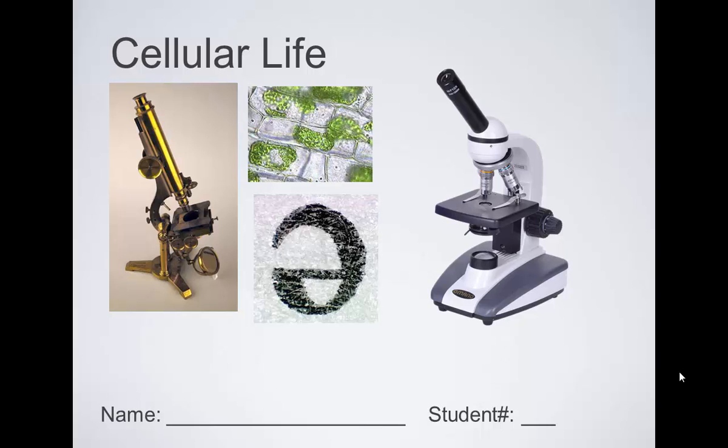And you know, what development, what technology did people have to really figure out before they could create the first microscopes? It didn't look like this. They didn't even look like this old one. They looked a lot different. But what's the key element to a microscope? Olivia?